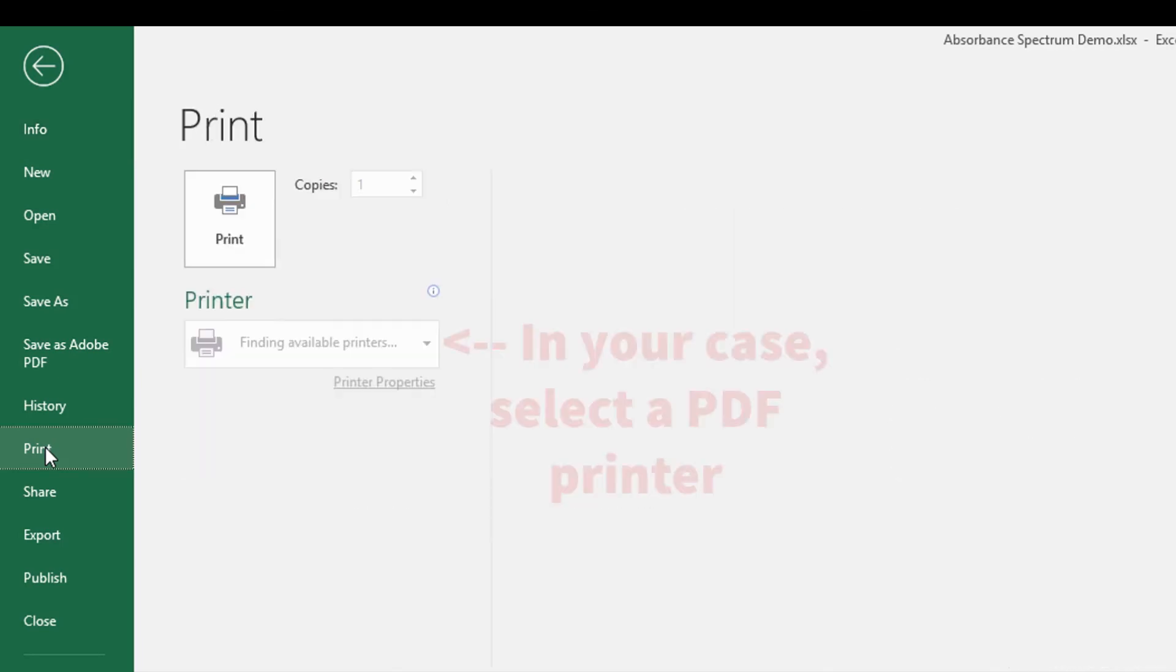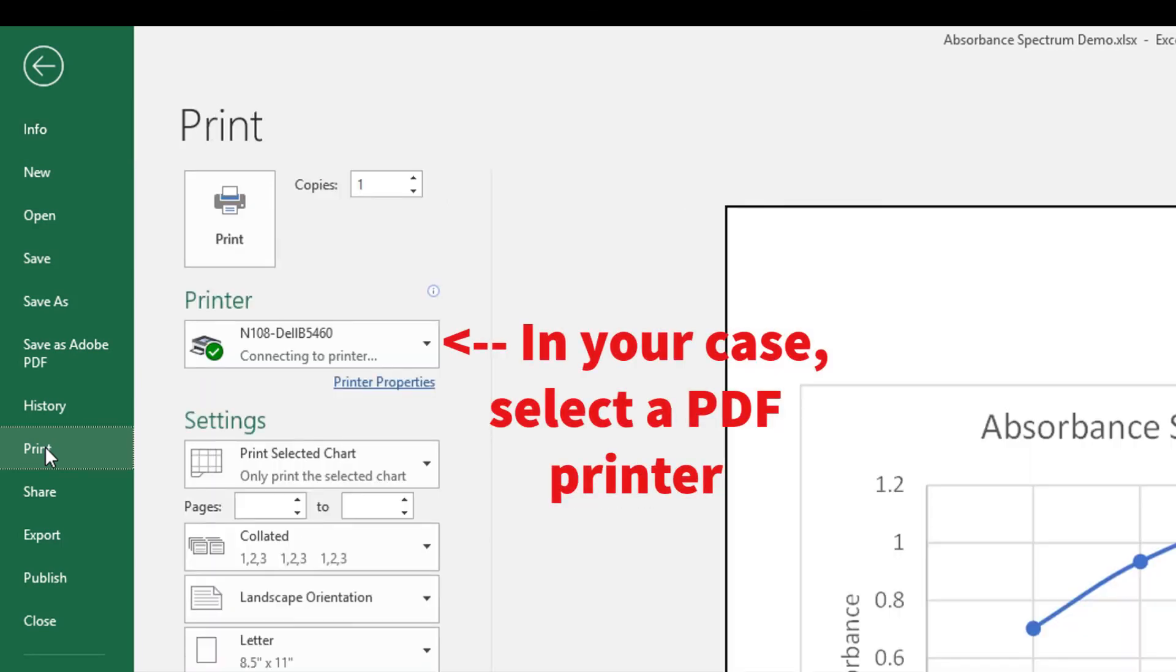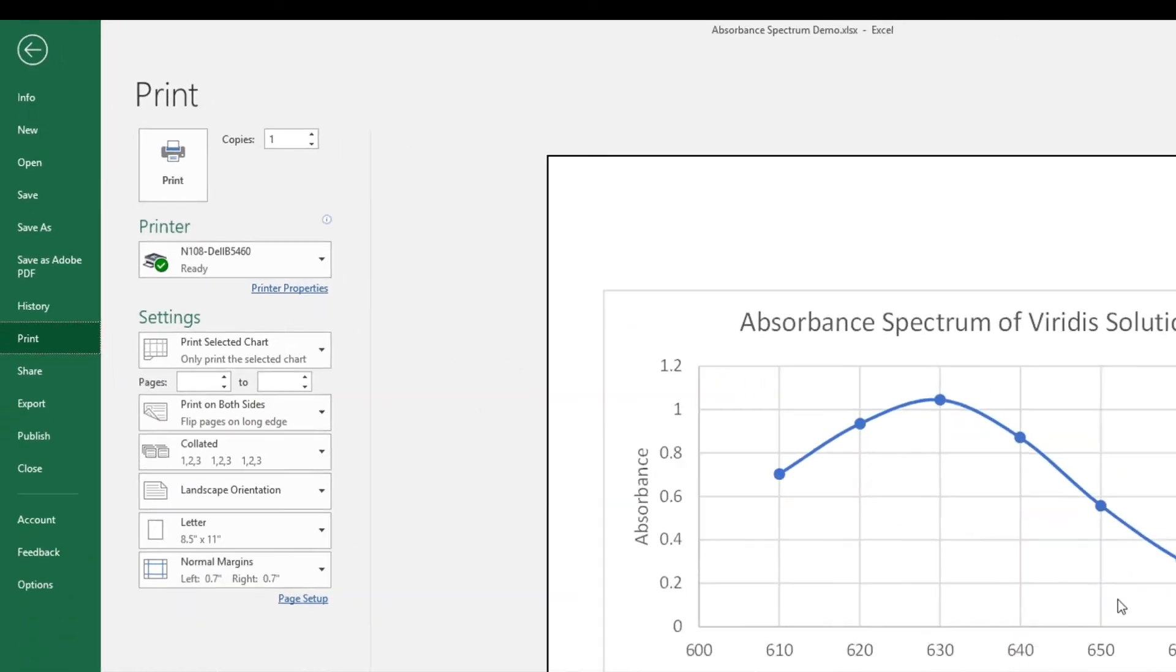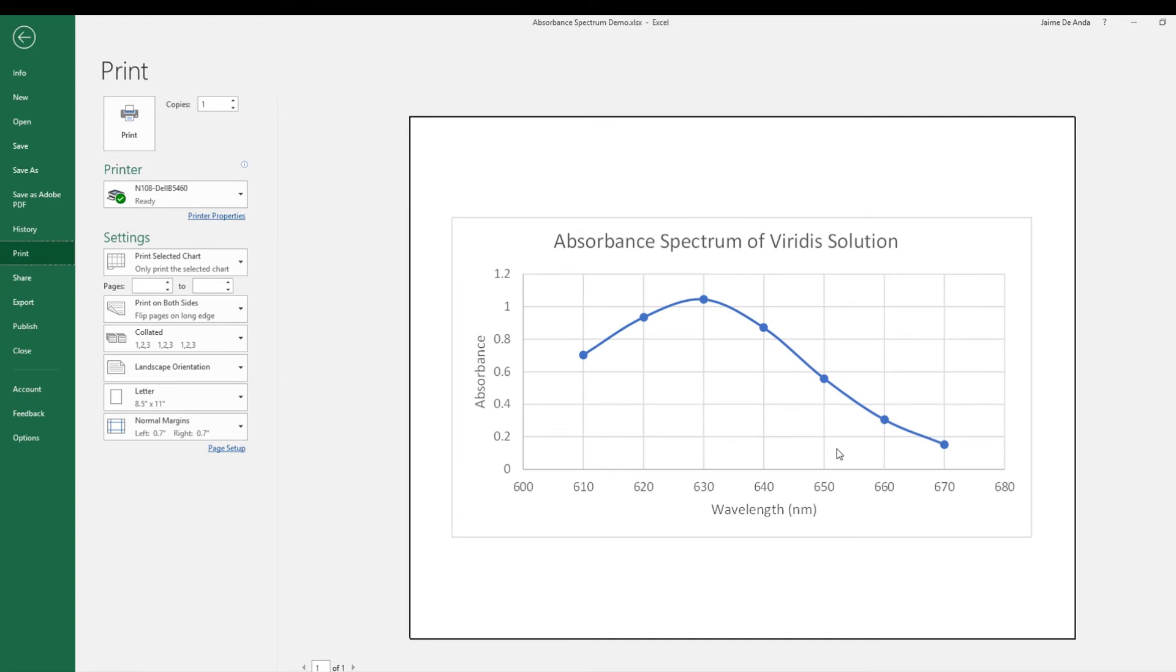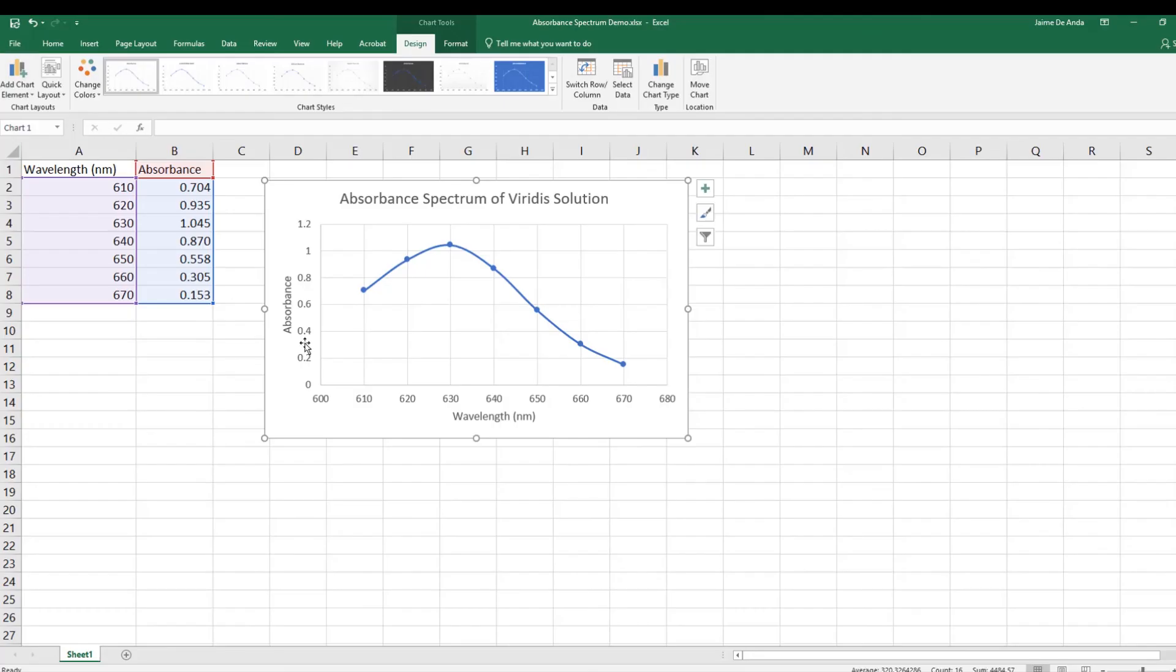But you're going to print and it'll show just the absorbance spectrum of your viridis solution. And you can tell there based on this plot that your wavelength of maximum absorbance that you chose is probably correct, 630 nanometers. I'm going to come back here, let you take one last look at the graph.